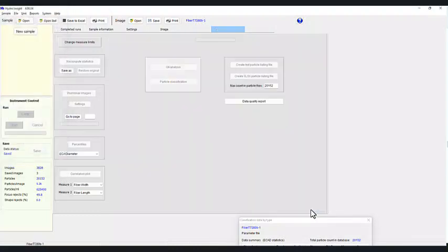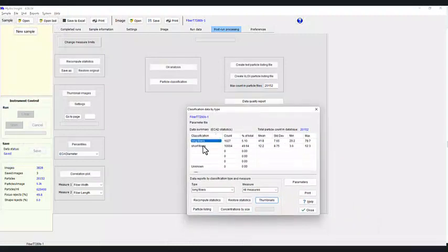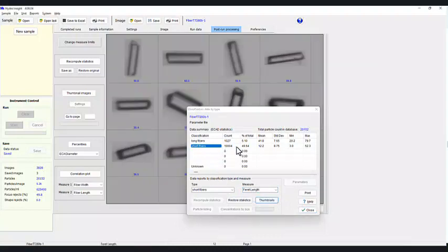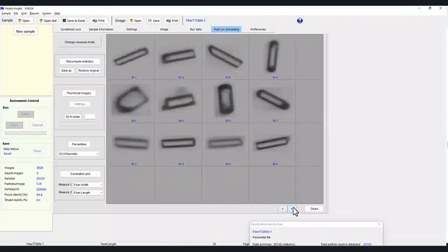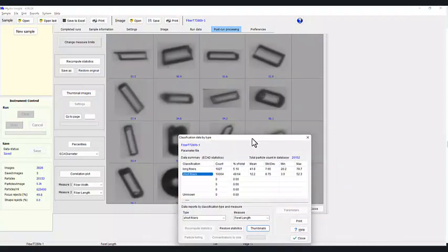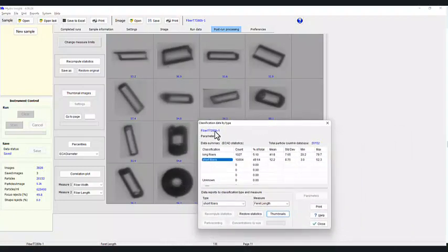And then we can also look at, let's say, length. For the short fibers, we can also do the same thing and confirm that those are the short fibers. So again, there's a bubble, and there are going to be some particles that are classified outside of this, so they don't show up in the percentage of total because I only picked one statistic.